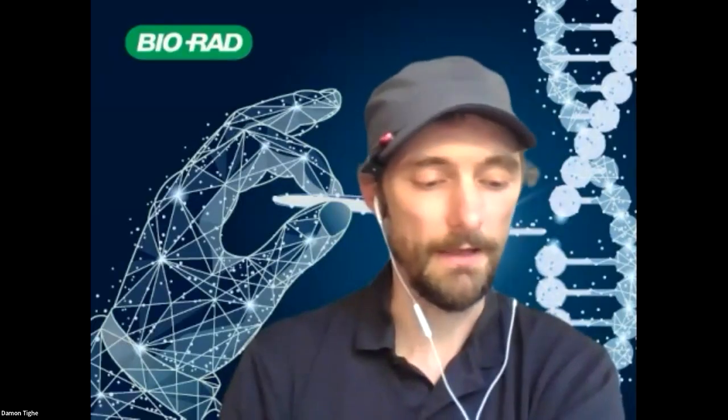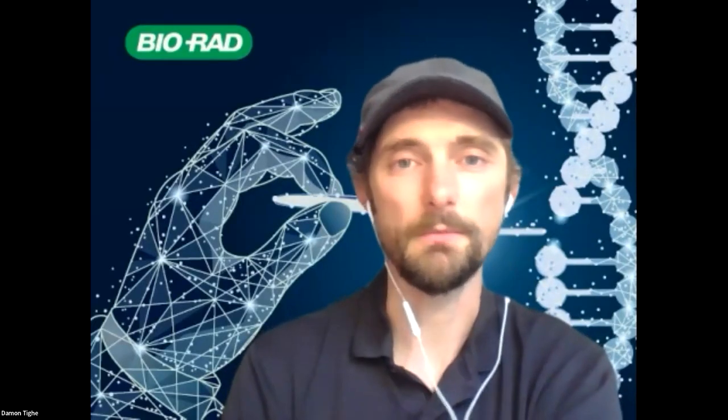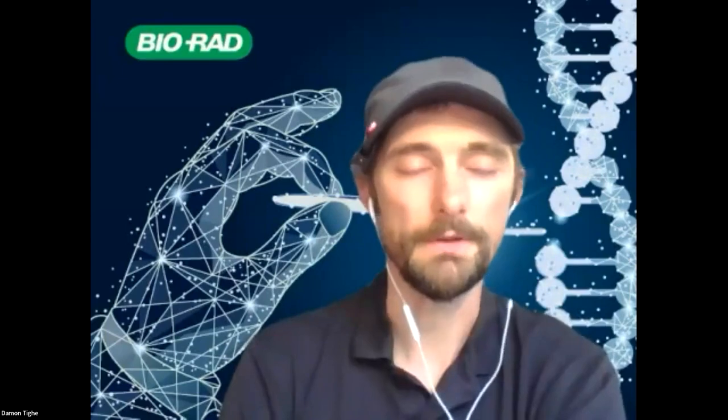Then there's a whole other series of Bio-Rad labs that are actually used in the LT collection, not just the protein one. I think the protein profiler kit, is that used? Protein profiler, the CRISPR out of the blue kits. I mean, a whole bunch of the ones that we offer there. Yeah, and it's just for the live data collection.